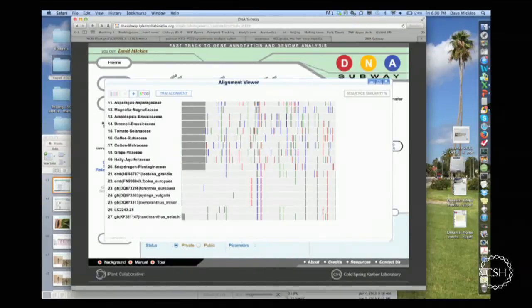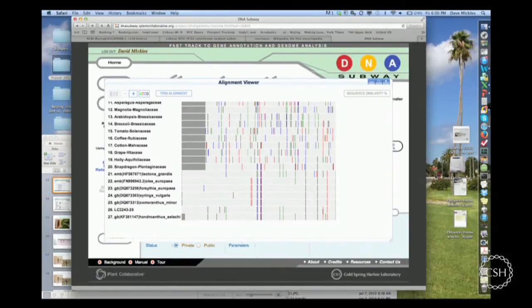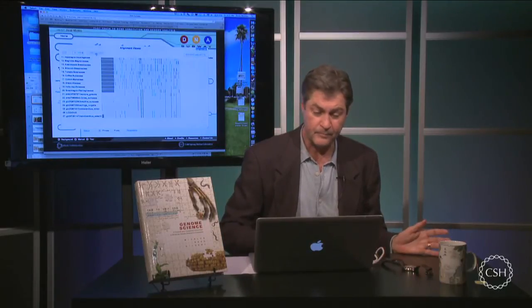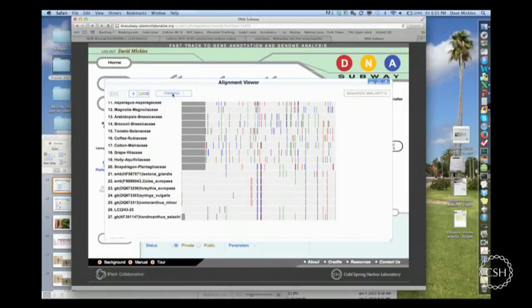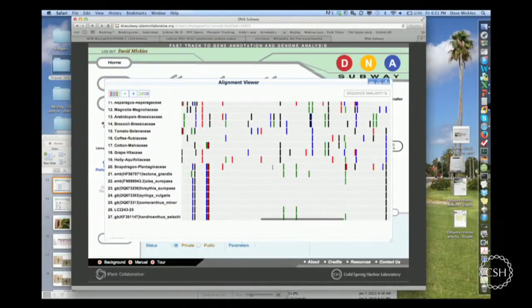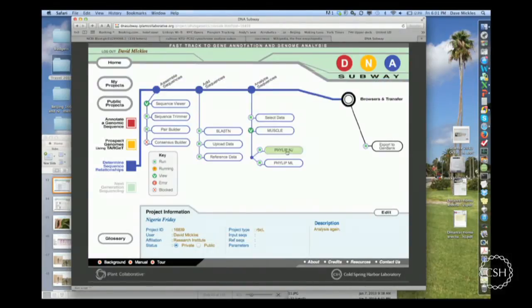So the point that I'm showing you here, last time I got a very, very close match, just one nucleotide difference between my sample, the Akparata, and the Ephelia. In this case, I'm off by a bit more. And if I trim this alignment, I can also quickly build a tree. And there's the trimmed sequence. Again, you can zoom in as much as you like and scroll through it to see the differences between the samples. I'll build a quick tree.